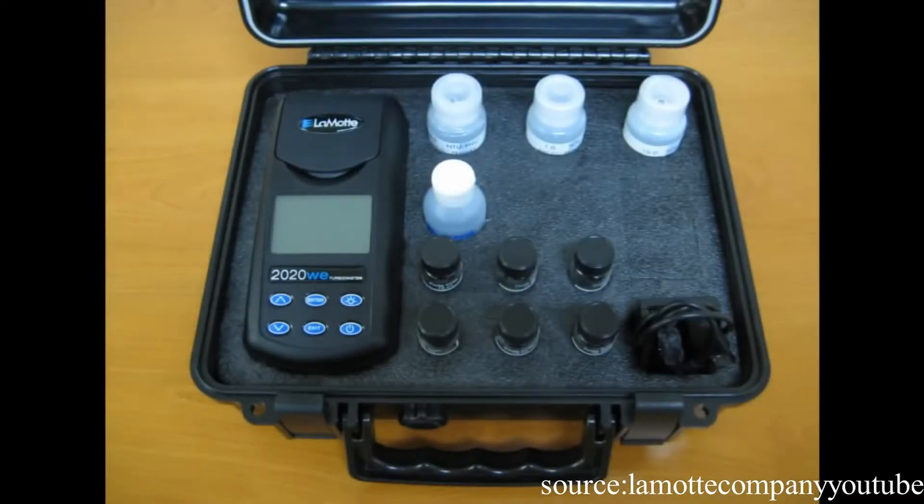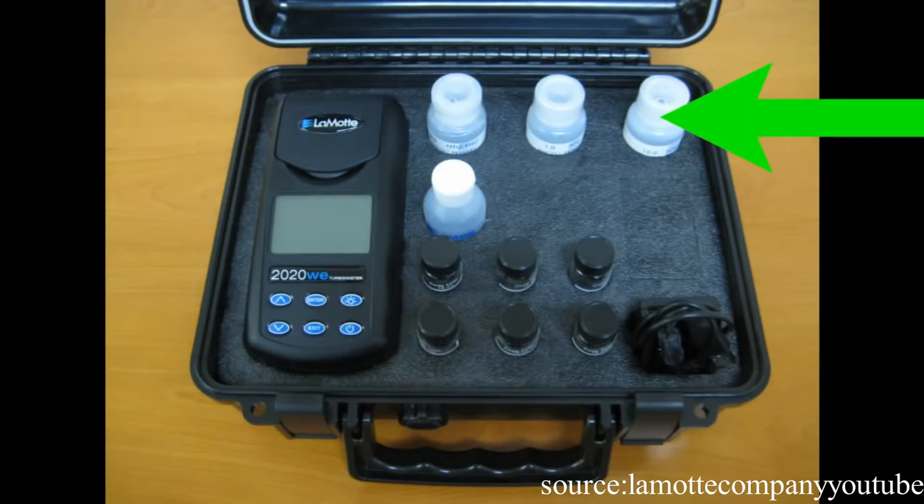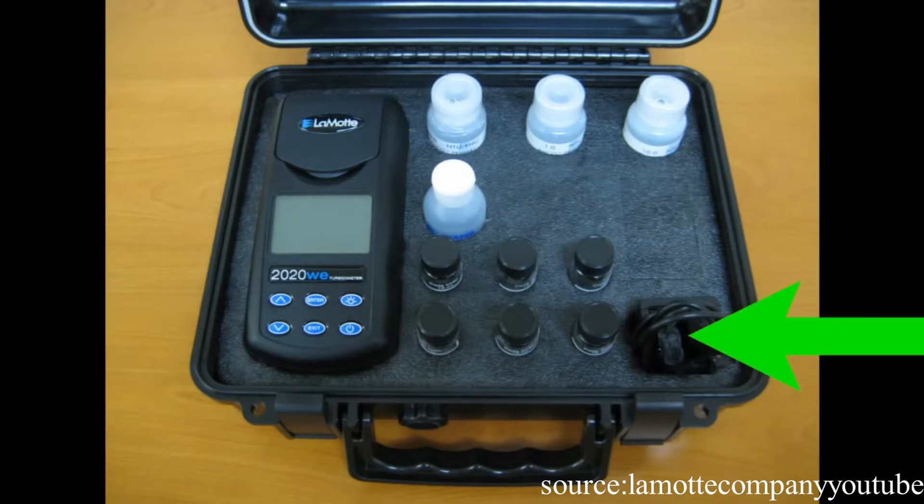This kit comes complete with a carrying case, 2020 WE or WI meter, six sample tubes, three AMCO calibration standards — 0, 1, and 10 NTU or FNU — one water sample bottle, a USB cable and wall plug adapter.